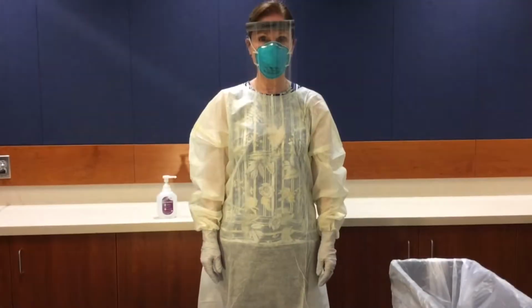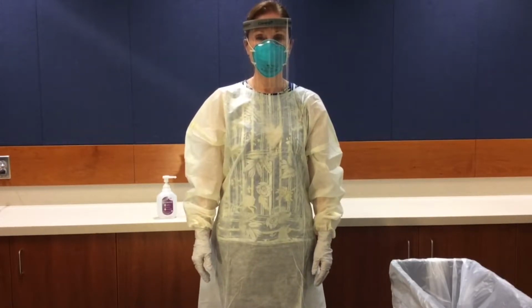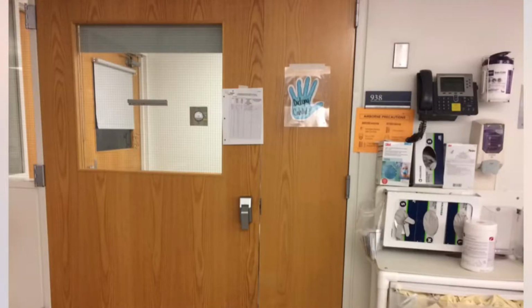Now we will review PPE removal, or doffing. Where PPE is removed depends on whether the patient room has an anteroom. If there is an anteroom, all PPE, including the N95 respirator, can be removed in the anteroom. Airflow from the anteroom is being pulled into the patient room, so respiratory protection is not required in the anteroom.